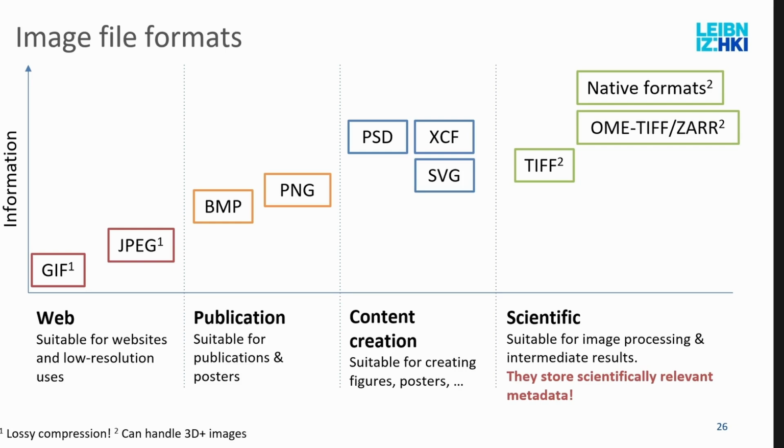And then you can later go back, you can later down convert it to something that is maybe more compatible, because these native formats only few softwares can actually handle. For example, ImageJ can convert them internally into its own format, or Imaris can do the same thing, like converting into an IMS file. But keep them around because then you might need to go back and extract some information that is very specific to your case, and then you regret it if you deleted them. And then the others you can use for intermediate processing.